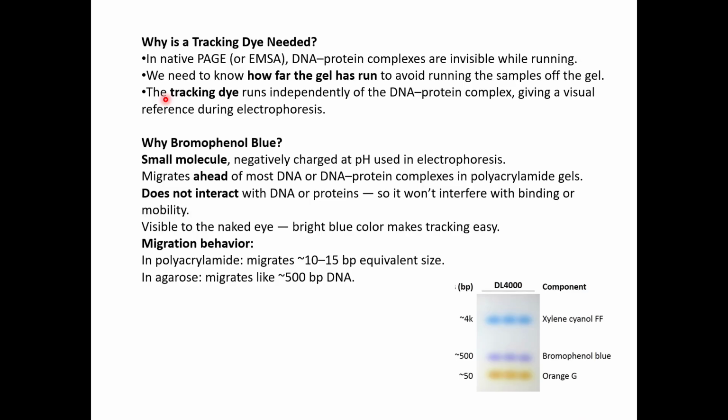The tracking dye runs independently of the DNA protein complex, giving a visual reference during the electrophoresis. So your tracking dye does not interact with your protein or your DNA or your sample. It is just present in your sample along with your protein or DNA.